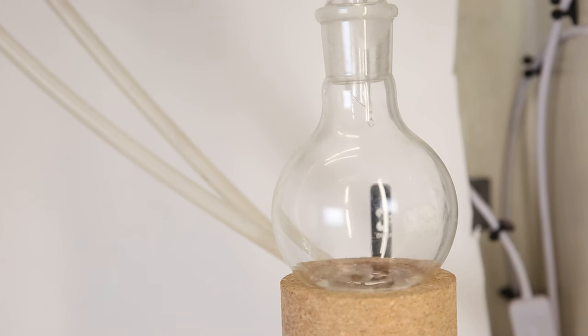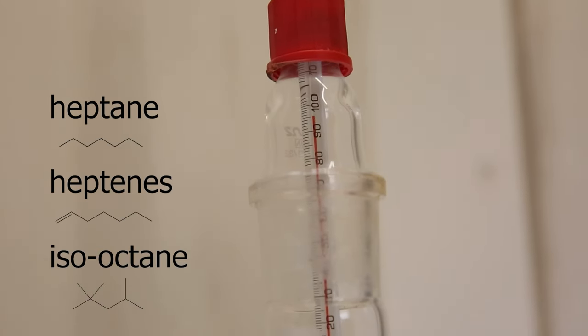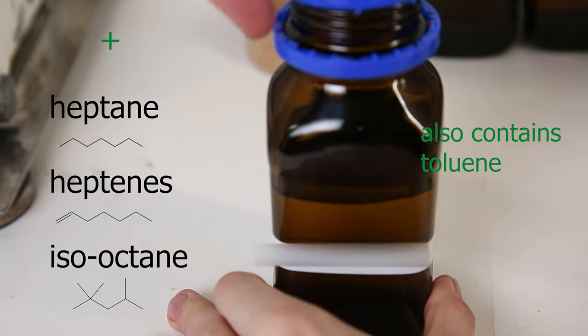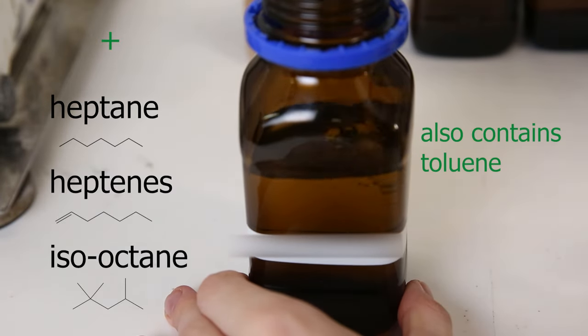I start distilling over the rest of the liquid around 96°C, which should be straight-chain heptanes, heptenes, and iso-octane. When that was finished, I added this fraction to the other fraction, containing most of these compounds.